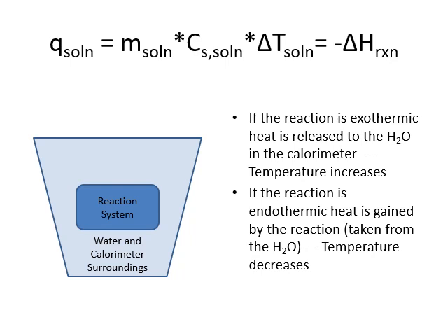If the reaction is exothermic, it's going to give off heat and the temperature of the water is going to increase. If the reaction is endothermic, it's going to absorb heat and the temperature of the water is going to decrease. And there is one of each of these in the reactions that we're looking at today.